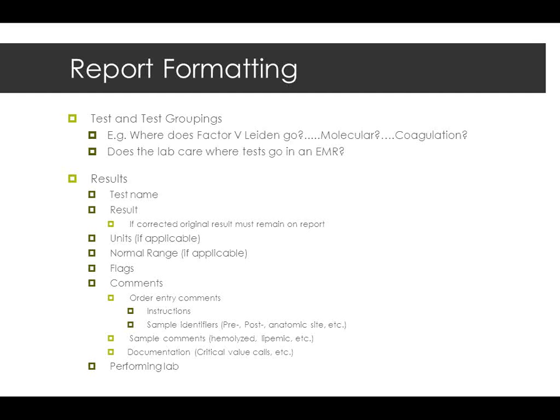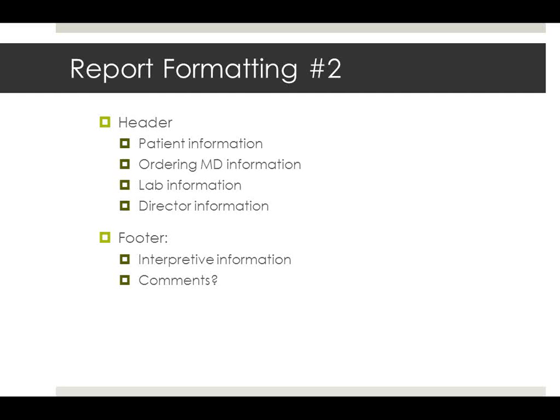Microbiology is an exception since virtually all of that is done there. Those are all keyed as China Basin labs. But you have to have the performing lab. If I send it out to Quest, then I have to specify in that result that this was performed at Quest, with the street address of the lab that did it.